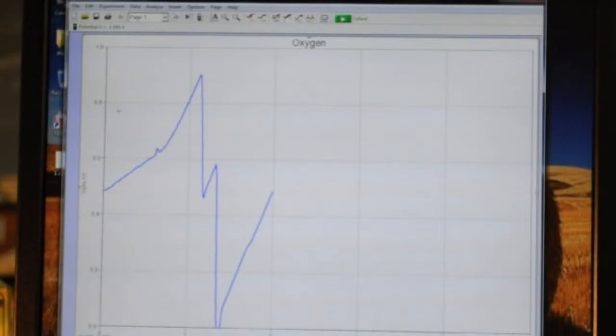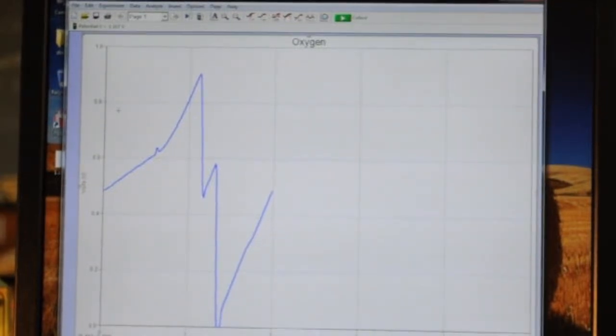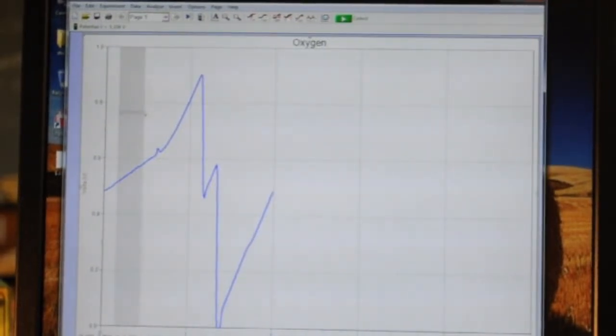When you have completed an experiment click the red Stop button at the top of the computer monitor. After stopping the data collection you can use LoggerPro to determine the various rates. Click and drag over a linear portion of the first experimental condition. Then click the Regression Analysis button and LoggerPro will calculate the slope. Repeat this for all experimental conditions. When the analysis is done print a copy of the output for each person in your group.